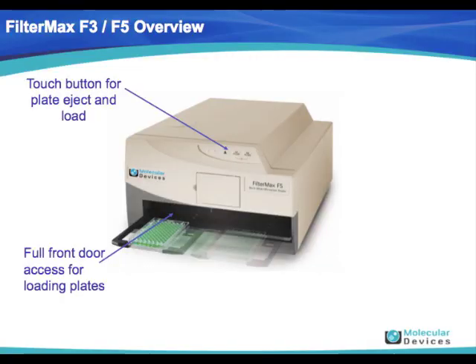This is an overview of the machine we'll be using to measure the fluorescence of our samples. To open the loading tray, press the eject button shown by the upper arrow. When the door opens, your plate should fit right into the loading plate slot. When you're finished loading your plate, press the eject button again to close the door.